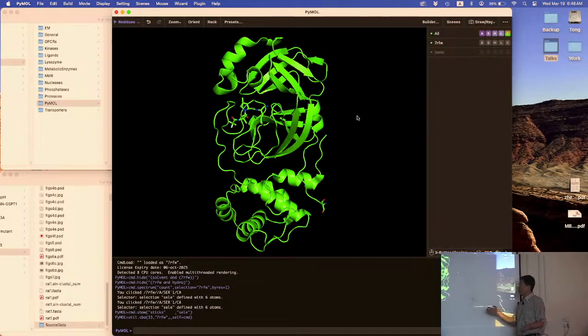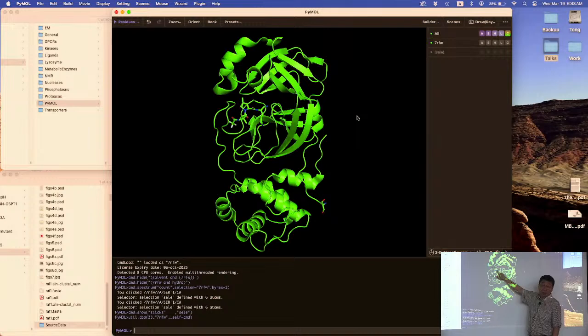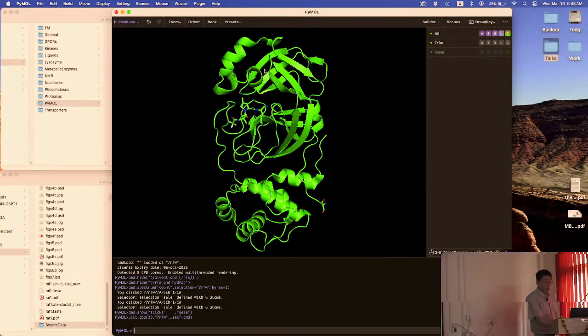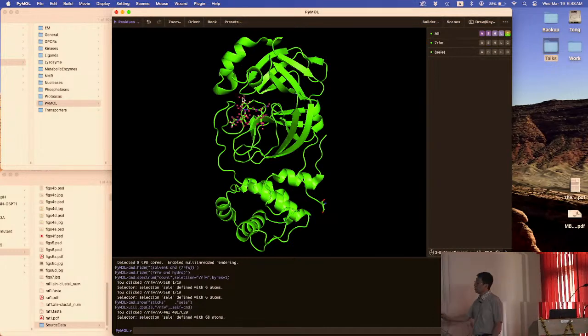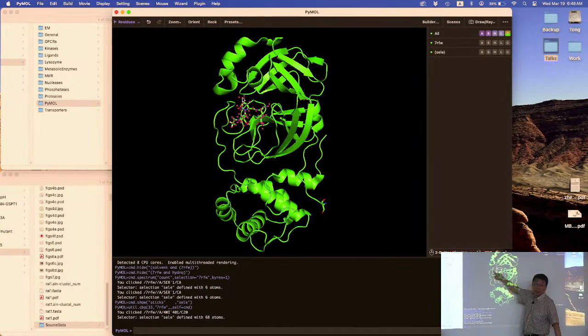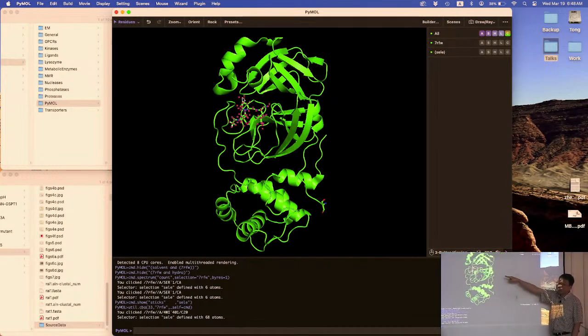Let's play color a little bit more. So this is the protein. The inhibitor is up here, the stick model. That's green as well, doesn't stand out. So let's give it a different color. So you click on the inhibitor, anywhere on any atom on the inhibitor. So now you see little squares on all the inhibitor. You see that? So that means you have selected the inhibitor. That means the select here now is the inhibitor, no longer this residue, but that one.